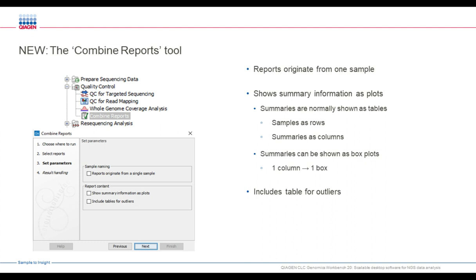Metadata tables are easy to construct — you can do that within the workbench or in Excel and import it, creating a metadata table and linking it to the data and algorithms. The Combined Reports tool is also new. Reports can originate from one sample — if one workflow has many steps and creates many reports, you can create a combined report on that one sample from all those steps to quickly get an overview. You can also do it for several samples in one report so you can quickly spot outliers and deviant samples. Summary information is shown as plots and includes tables for outliers.